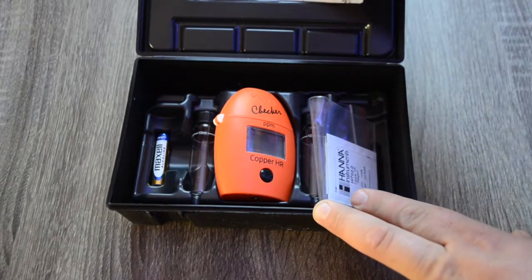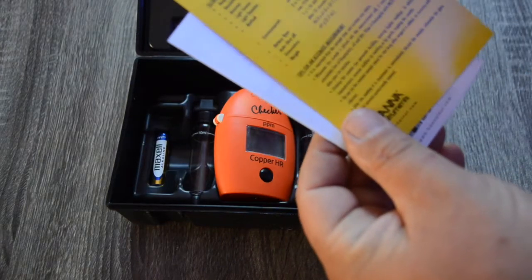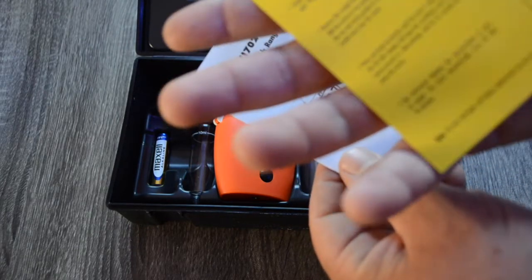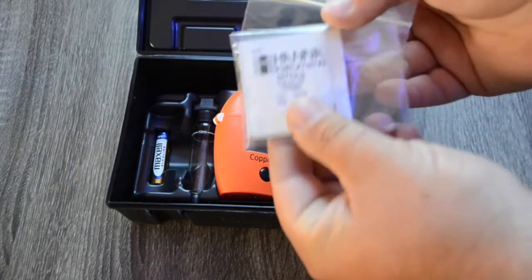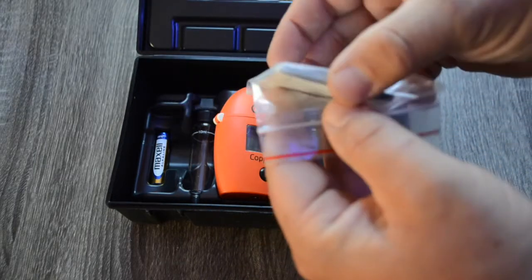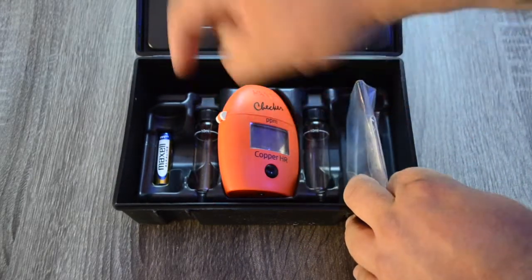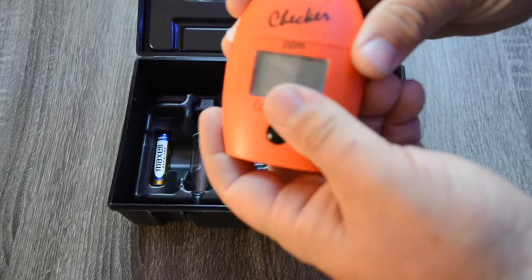When you open up your box, you have your instructions — I highly recommend everybody reads those before using a Hanna checker. Then you have your quick guide, which is very important to keep. Then you have your reagent for the Hanna checker. Usually when you first buy the kit there aren't too many of these included, but you can buy more.